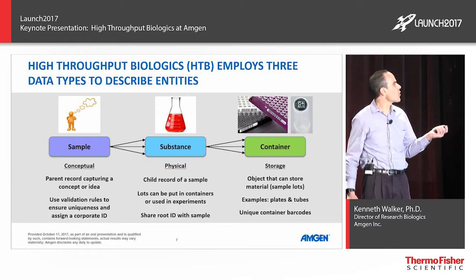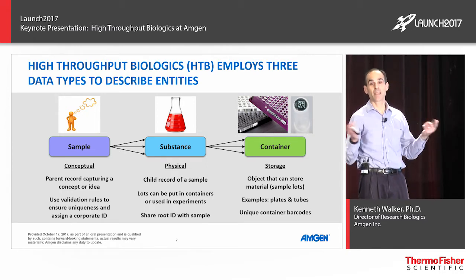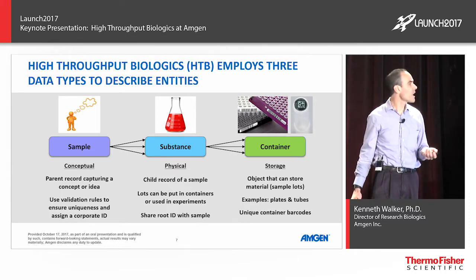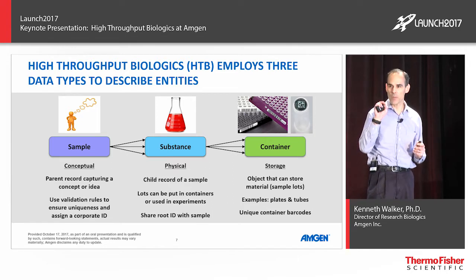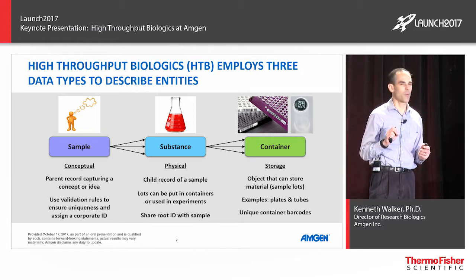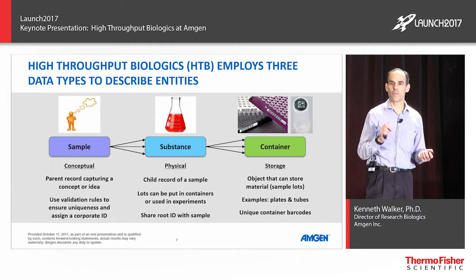So for instance, you might have samples in a 96-well plate that has a single barcode on it, and you have 96 different samples in there, each of which is connected to this barcode and then the location it is within the plate. Another common thing is that we often use these little barcoded tubes, and these little 2D barcoded tubes, the 2D barcode is very small at the bottom. And we don't want to put an adhesive label on these tubes because the adhesive label is not very compatible with robotics. You put those in a -80 freezer, the labels start to peel off, and if you use robotics to try and pull it out, it ends up jamming up the works.